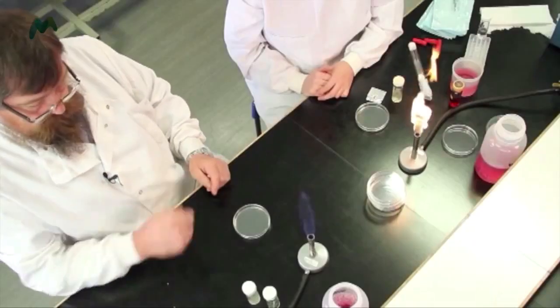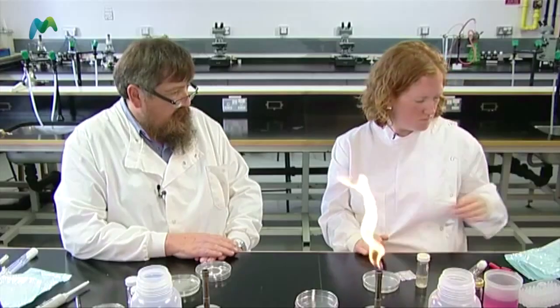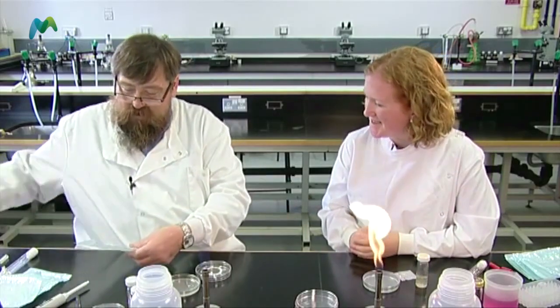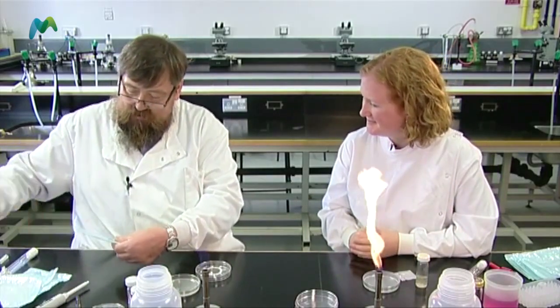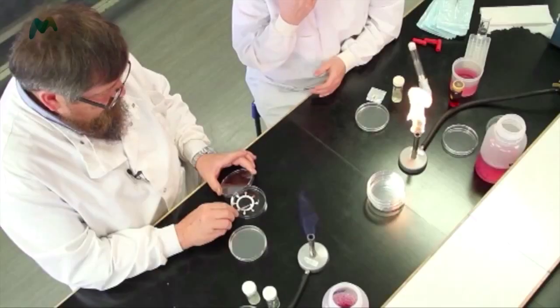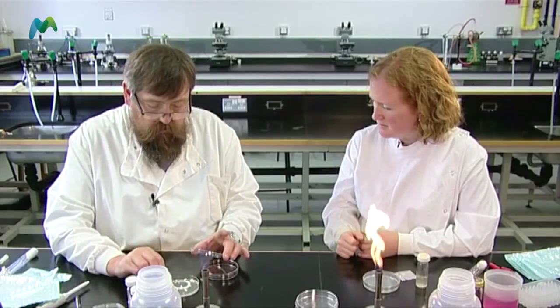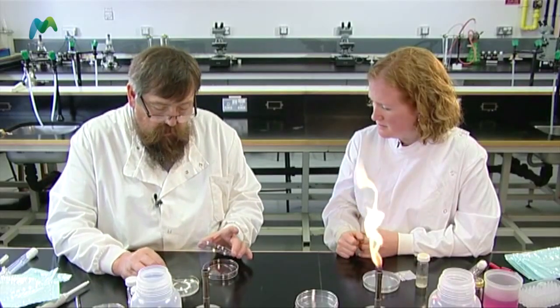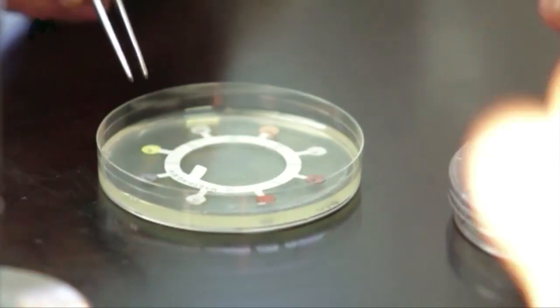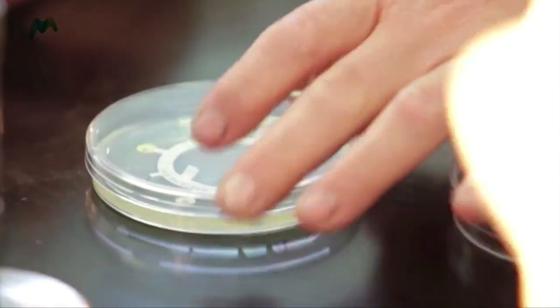The secret is to take my antibiotic discs and place them on as soon as I can. I need one of your forceps. I take off the end, take out the forceps, and very carefully lift that up and place it right in the very middle, gently touching the disc so that it sits on the agar. Once I've done that, I can put the lid back on.